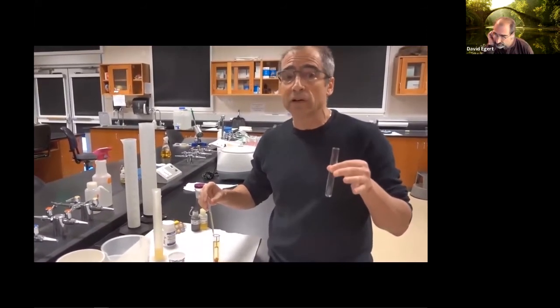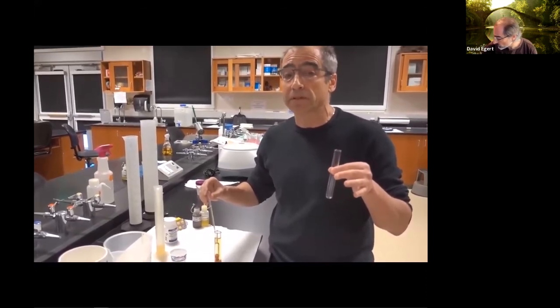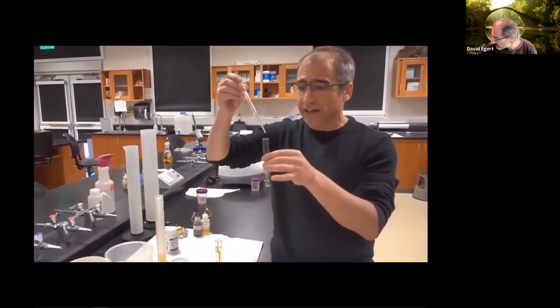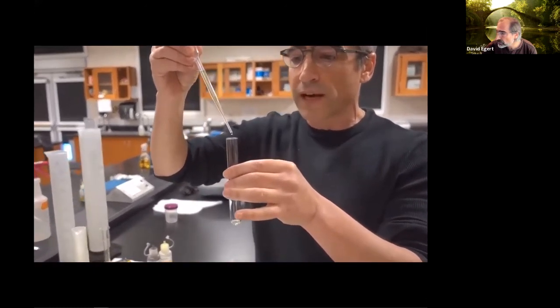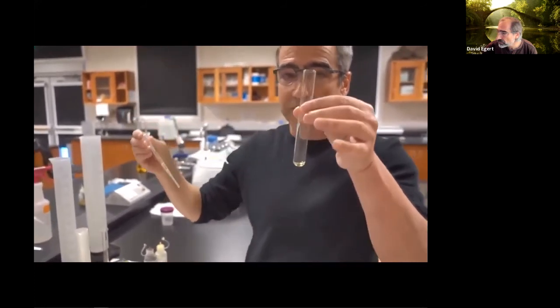This is a quantitative test, and it depends on numbers of drops that you're adding of different reagents. So it matters that I'm careful to add exactly 1, 2, 3, 4, 5, 6, 7, 8, 9, 10 drops of my urine.